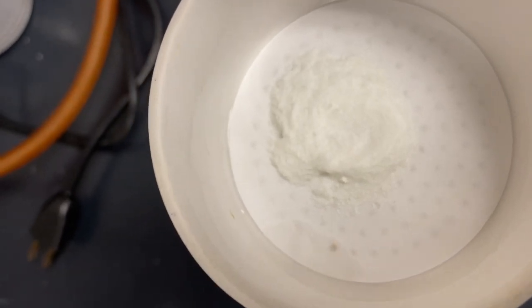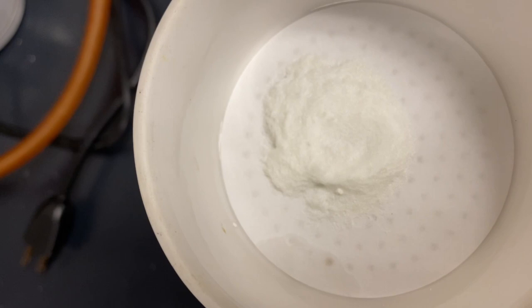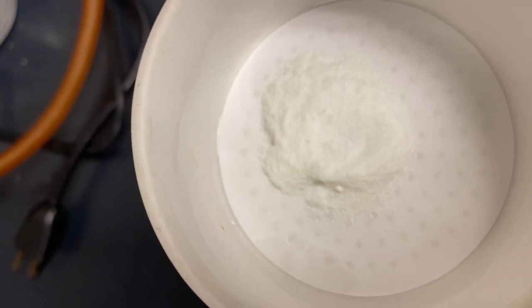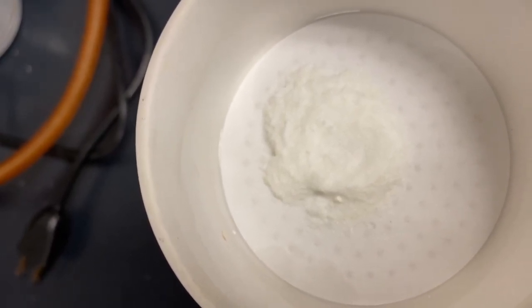So once this dries, we're going to get our infrared spectrum and melting point, and of course the mass of our product that we've made. And we've already weighed this filter paper, so that should make that process very easy.